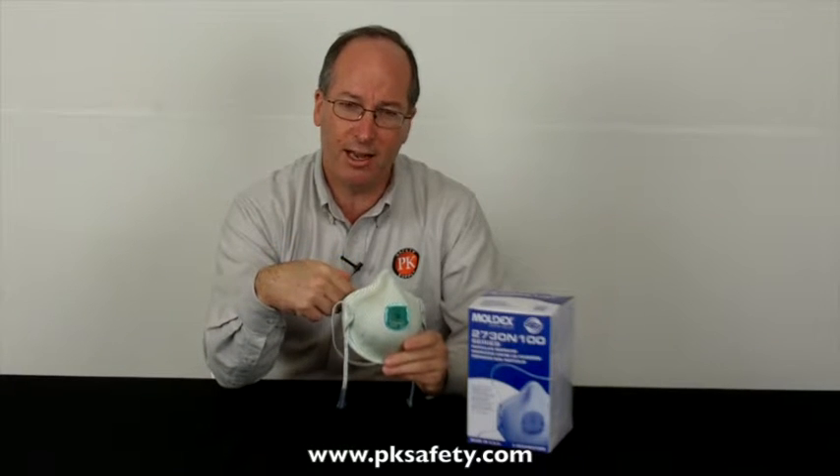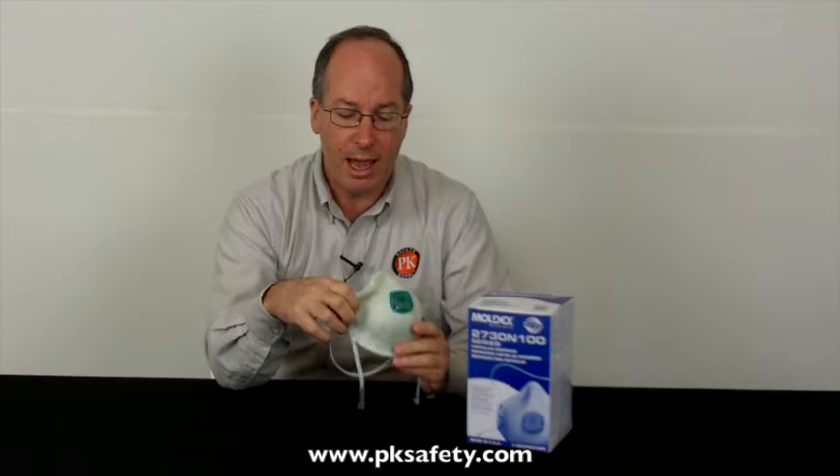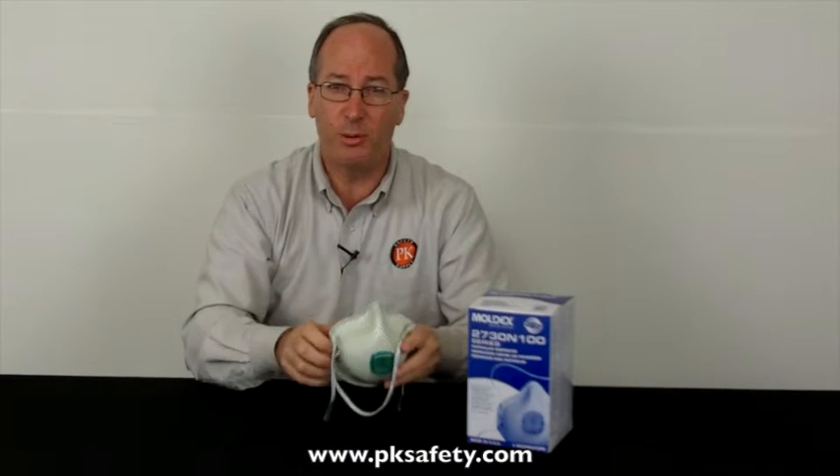We have the exhalation valve on the front. This means your exhaled air goes out through that valve rather than out through the mesh fabric, and what this is going to do is keep the mask cooler and prevent moisture build-up.